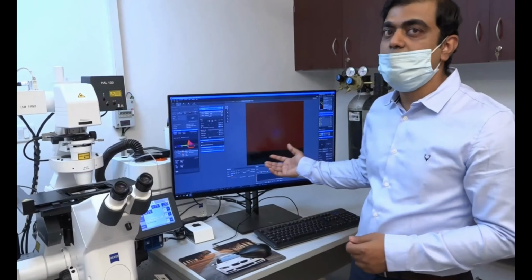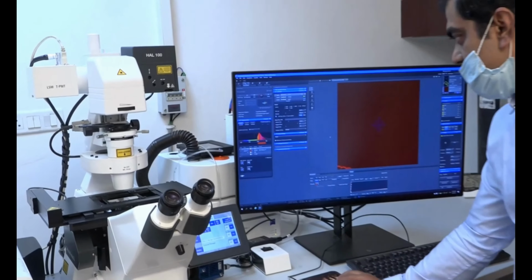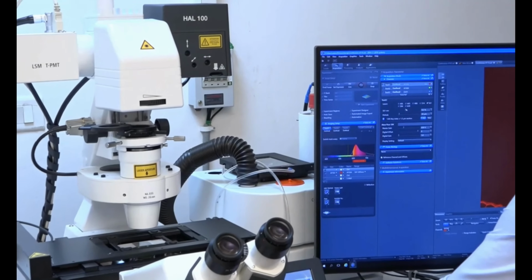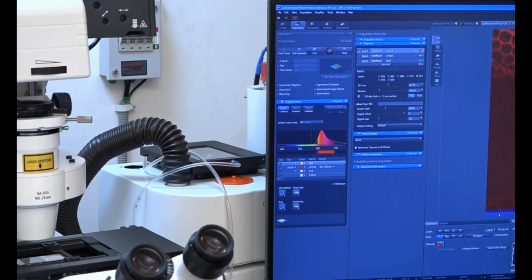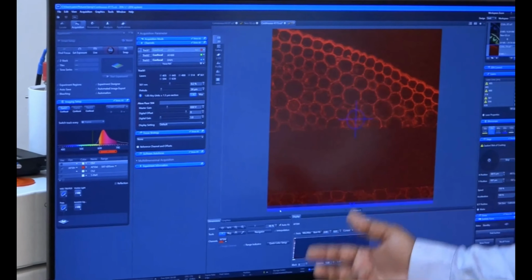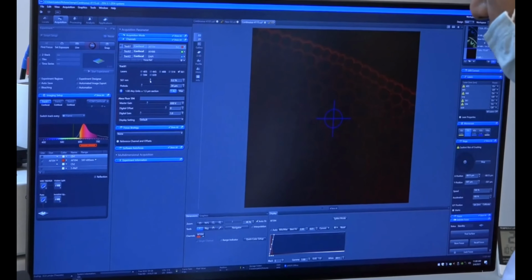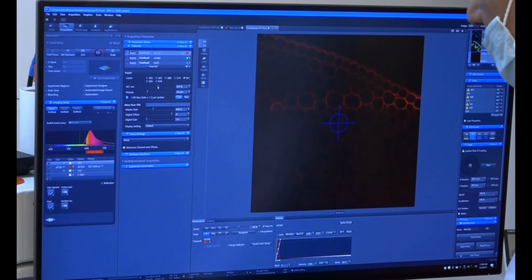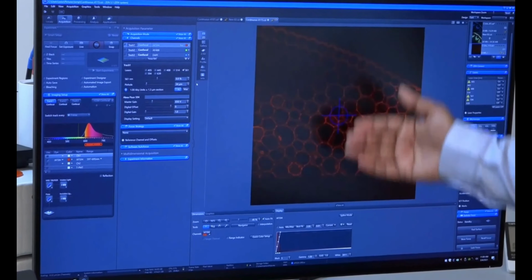So either this signal is not being excited by just 0.2% laser. So first thing is, I will just try to change the focus and see whether my sample is in focus or not. So once I quickly move, I see I get some signal here. Okay. So once I start getting some signal, I'll try to increase the laser power slightly so that my signal intensity improves. So you see, with just 0.2 to 0.9% of the laser increment, the signal intensity has improved quite a bit.